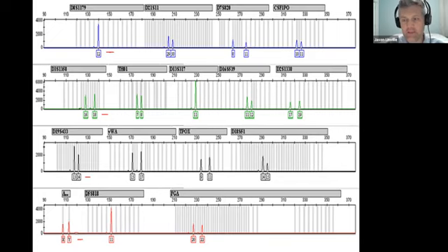The company that sold us this kit with these 32 primers in it, 16 pairs of primers, 16 forward, 16 reverse primers, they designed them so that D8 is somewhat close to the repeat regions. All the alleles for D8 are going to come out somewhere between 120 and 180.